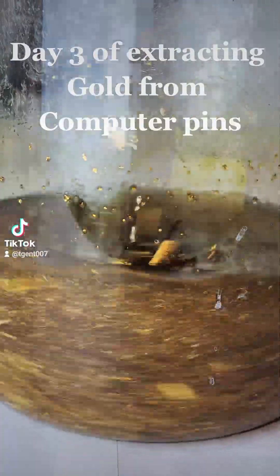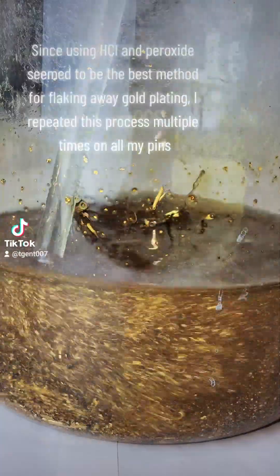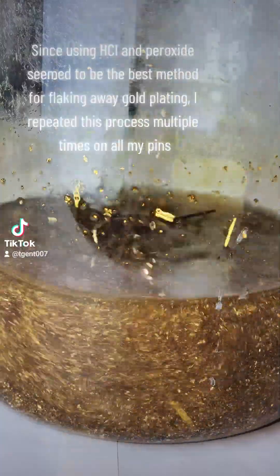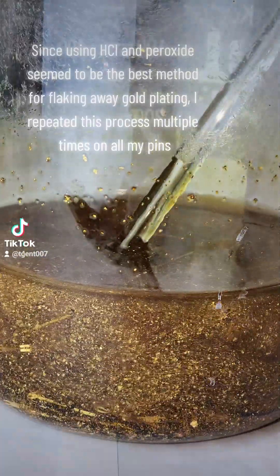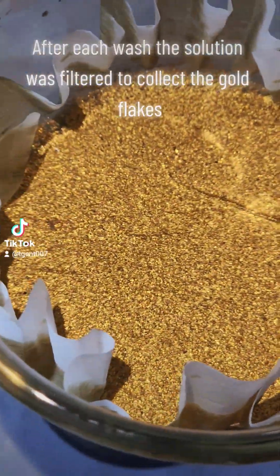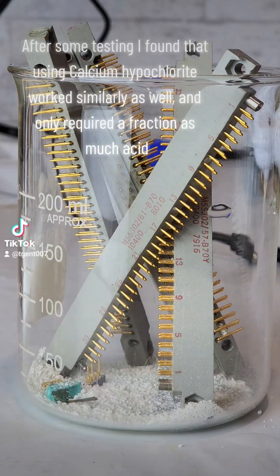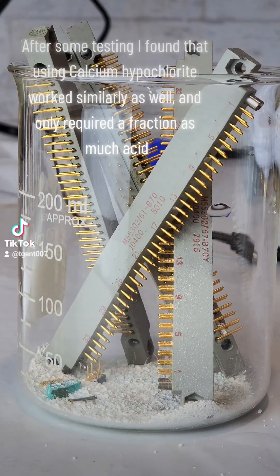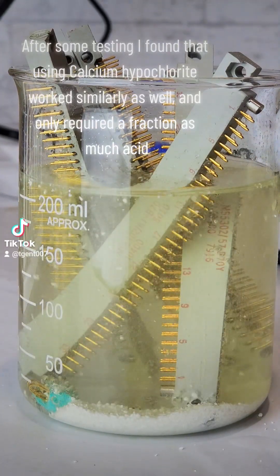Day 3 of extracting gold from computer pins. Since using HCl and peroxide seem to be the best method for flaking away gold plating, I repeated this process multiple times on all my pins. After each wash, the solution was filtered to collect the gold flakes. After some testing, I found that using calcium hypochlorite worked similarly as well, and only required a fraction as much acid.